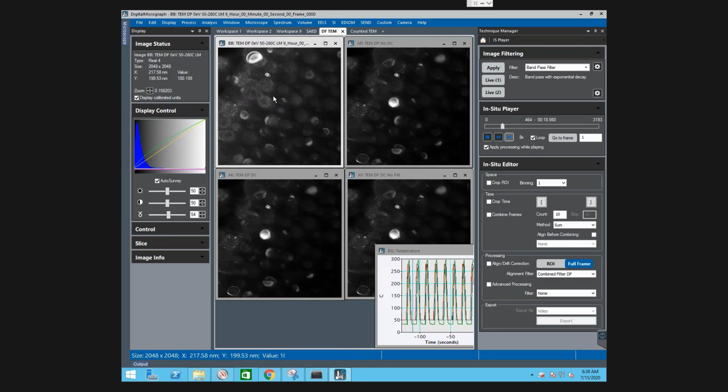So we can see that there's some small drift every time that I cycle the temperature. It drifts slightly. And it's quite good. It's quite a small drift, but still noticeable for sure. And so something I would like to do is to drift correct this sample.